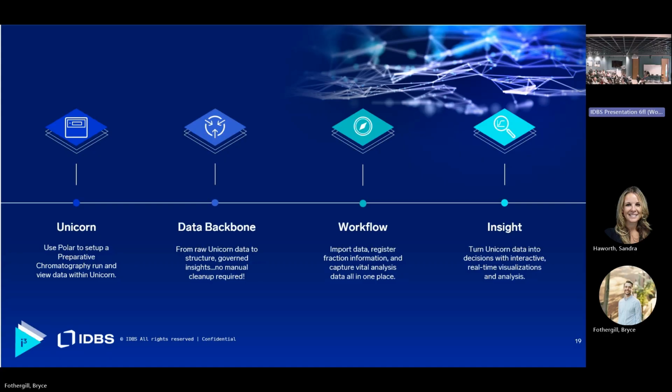Thanks for the info. Looks good. You talk about Unicorn. Is there any work that's being done or things being looked at with other CDS systems? So things like Empower, OpenLab, Chromeleon?